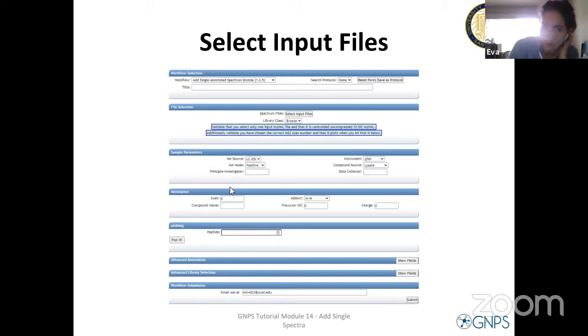Ming, is it okay if we don't have the workflow tab? Yes, that's a great question. So this is a side point. As a normal user of GNPS, we actually hide that. People got super confused back in the day, so I was like, screw it, it's hidden, only admins see it. So yeah, totally fine. It's kind of the Apple approach, I think. Whether it's better or for worse.